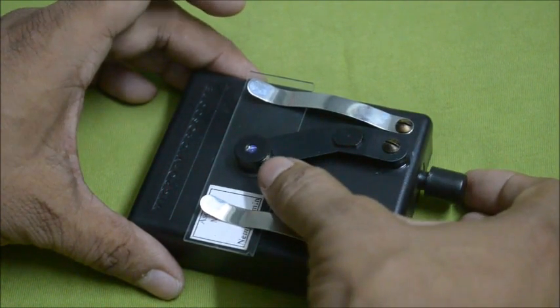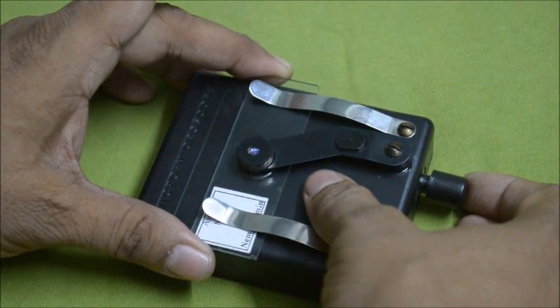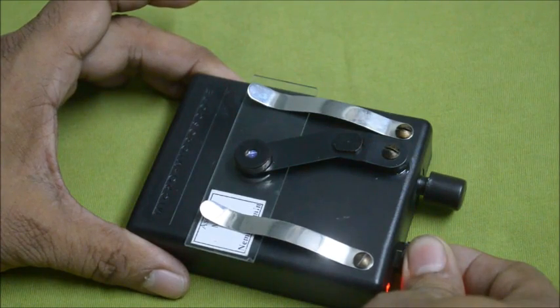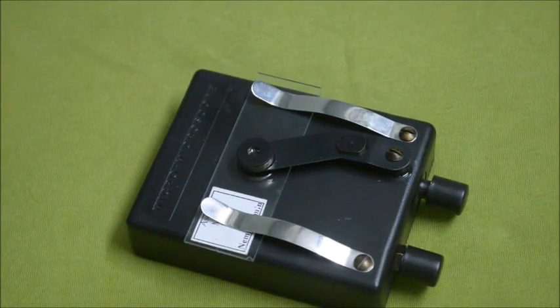Now use the focusing knob — just focus it and view through this viewpoint. It's very easy to operate; a class one standard student can use this micro microscope. After use, switch it off. Adjust the brightness and focusing knob clockwise and anticlockwise until you get a crystal clear image of the specimen.